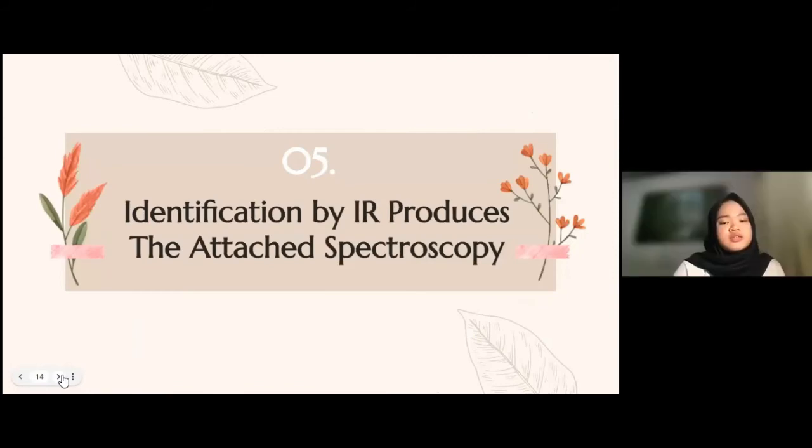Next, identification by IR produces the attached spectroscopy.